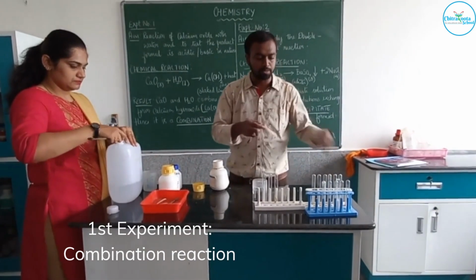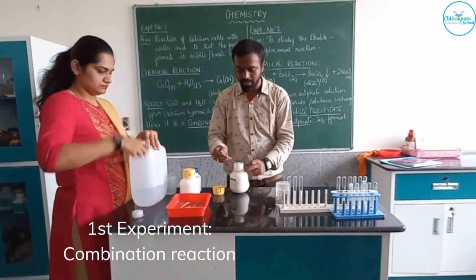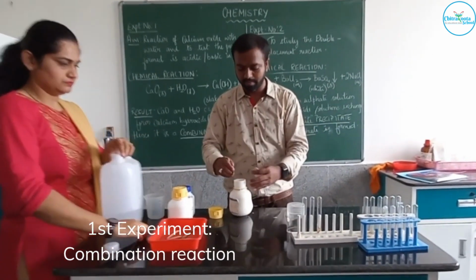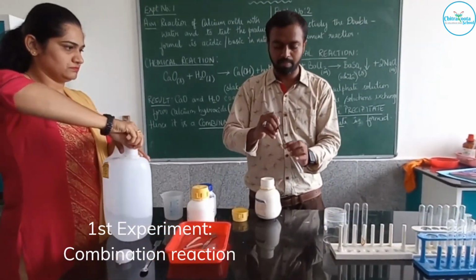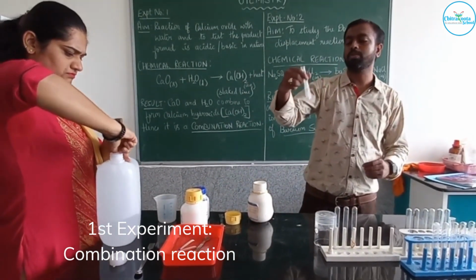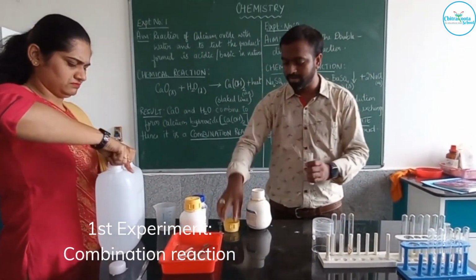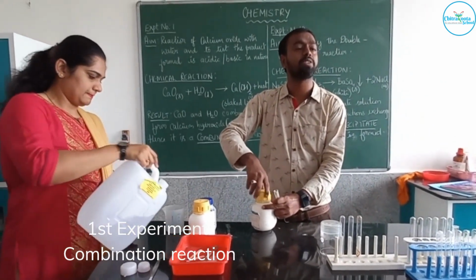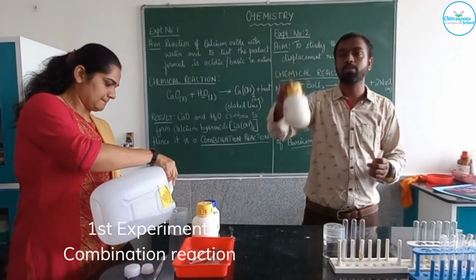We'll be taking a small quantity of quicklime. Quicklime is just like face powder. Salts also have two types; whenever you come to the lab, you can observe.